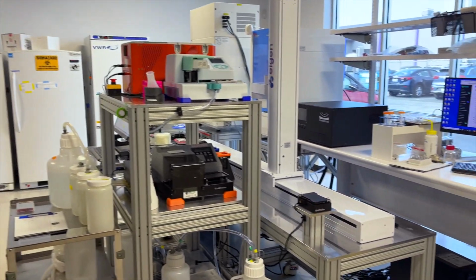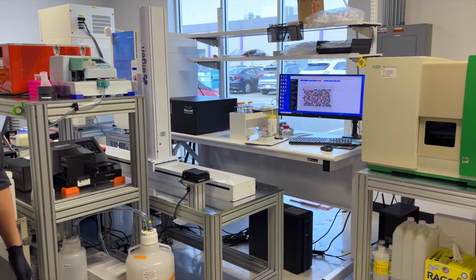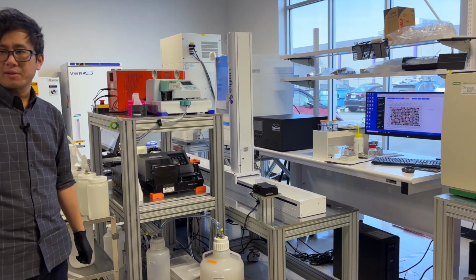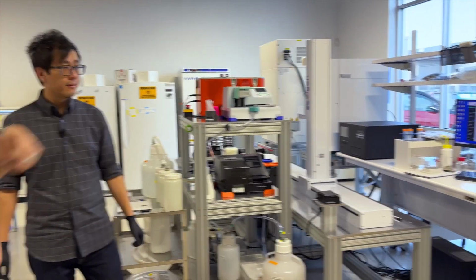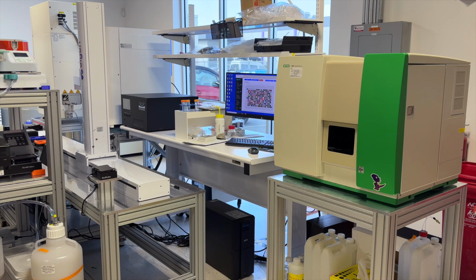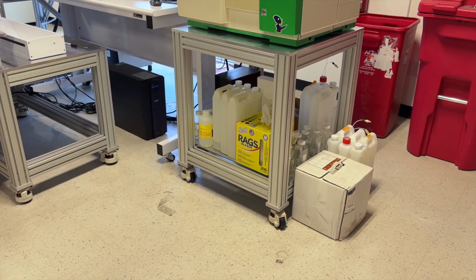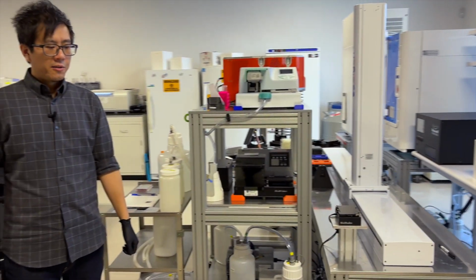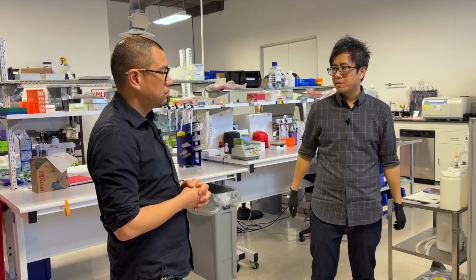So this work cell that we see here automates some of our core processes. There's compound addition, the process I mentioned before of drugging your cells at high throughput, as well as a lot of the steps for flow cytometry. I see, yeah, I see you have another flow cytometer here on a similar cart with wheels. That's right. So this one is the one that's closer to our automated work cell. And in flow cytometry, there's a lot of standard steps that you would do on a benchtop that you pretty much want to translate into an automated system.